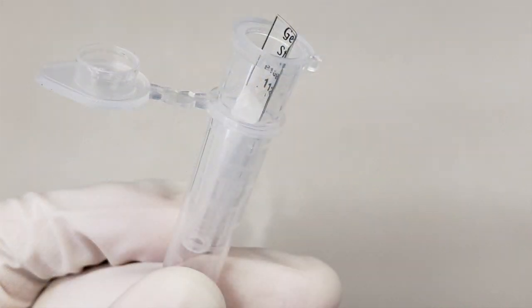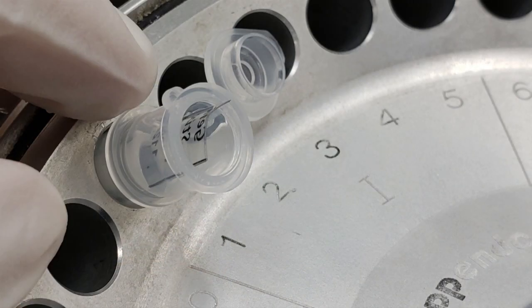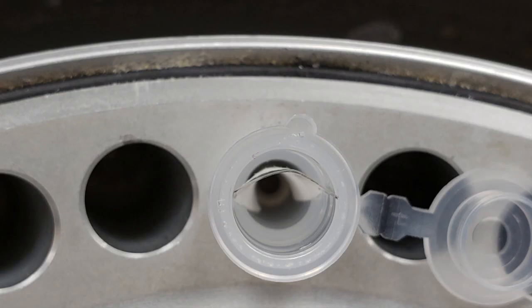Place the GeneStix with the Spin Funnel into a collection tube. Orient the tube as shown here with the notch pointing up, and the GeneStix curving against the notch.